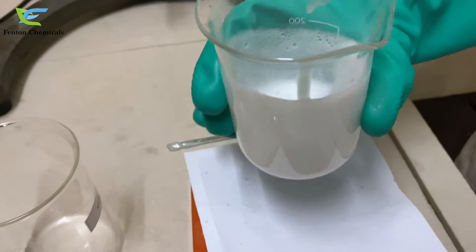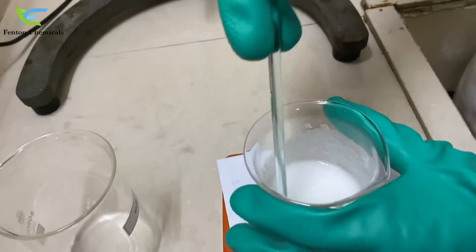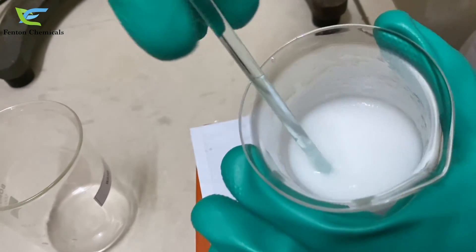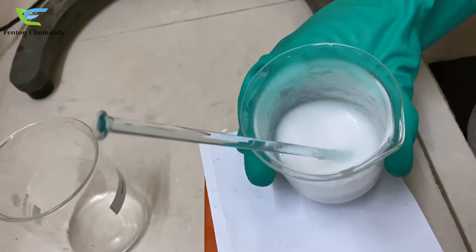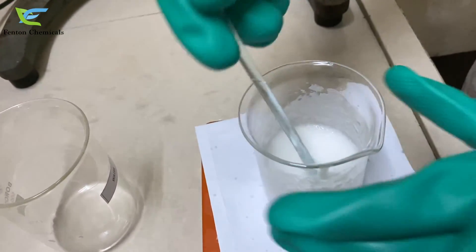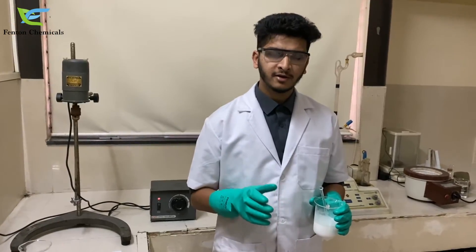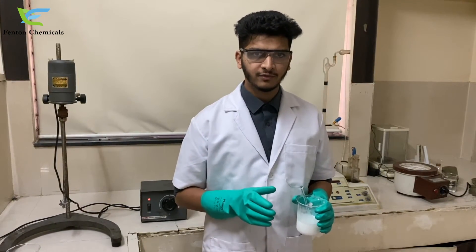As you can see, an excellent milky white emulsion is formed here. And now our silicone oil micro emulsion is ready. So now we have prepared a stable silicone oil micro emulsion using our emulsifier Decosol 50.